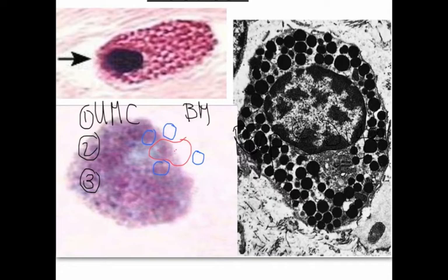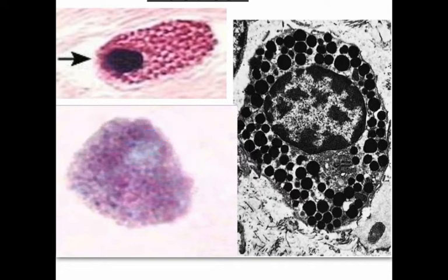Here, it is a metachromatic stain, where you can use toluidine blue to give another color than the blue color of the original stain, which will be, as you see in this picture, purple or red color. So these are mast cells stained with a metachromatic stain like toluidine blue to give a purple color here in this photo, or a red color in the upper one. This is a very important character for this cell.